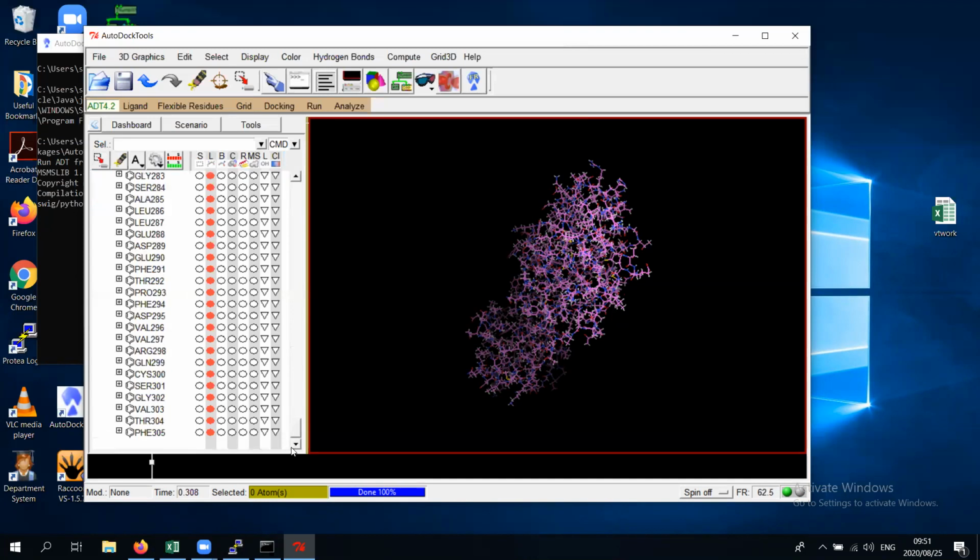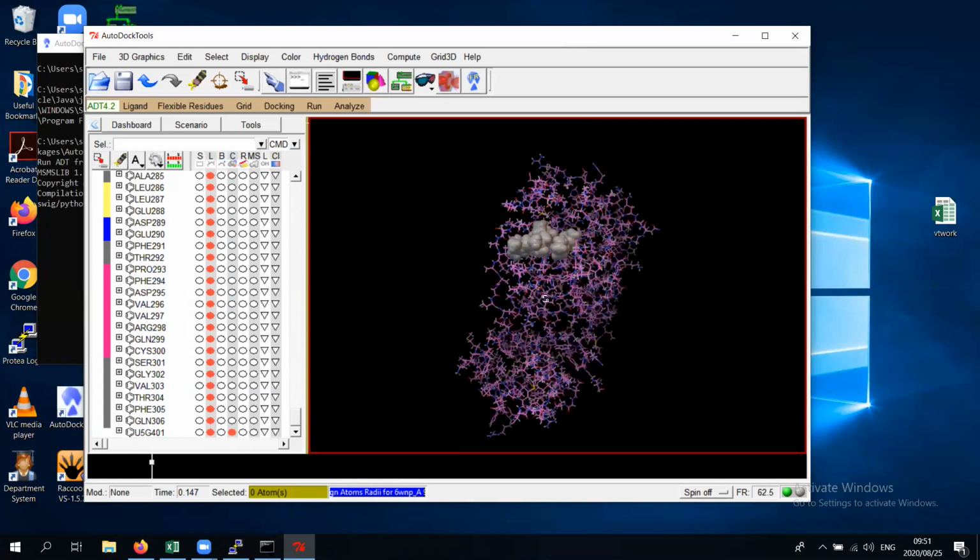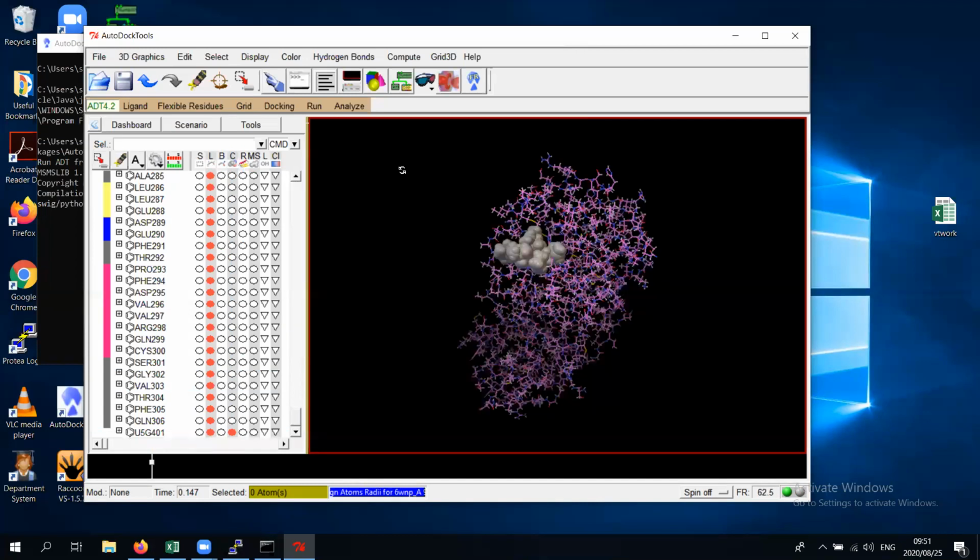And let's go into it and let's see. In here, I see that we do not have any DMS. We've got no non-standard residues. We've only got our co-crystallized ligand, which I'm going to highlight. See if I can see it. No, hang on. There we go. There it is. So there is the co-crystallized ligand, and it's fitting beautifully within the active site of that particular system.